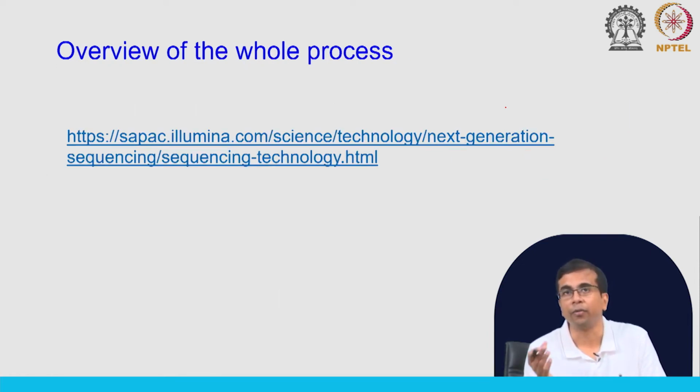Okay. So, here is an overview of the whole process that you can see. There is a very nice animation of the whole process, starting from the library preparation, the cluster generation, bridge amplification, then the sequencing, and you will get a very nice idea about the whole process.